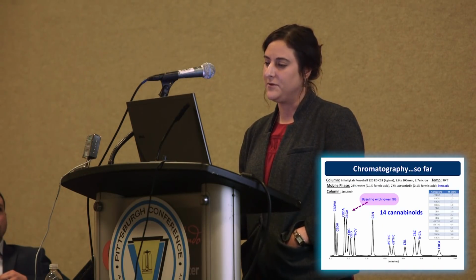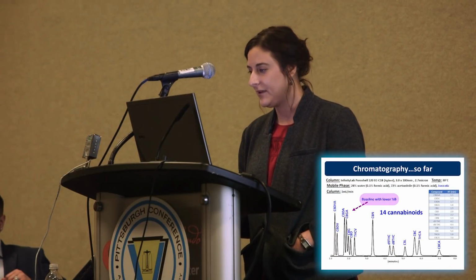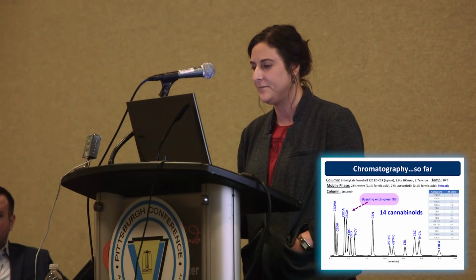So far this is the chromatography that we have. This is, I think, actually the same stationary phase that Anthony just talked about. Again, the dimensions are a little bit different. It is isocratic, so really, literally nothing fancy here. You can actually get a baseline resolution if you just back off the organic a little bit, so go about 68, 70. The problem with that is it adds more time, and I'm not into that right now. So you can do this. I think also changing the dimensions should easily get you to baseline. So, for this evaluation, I'm pretty happy with it.